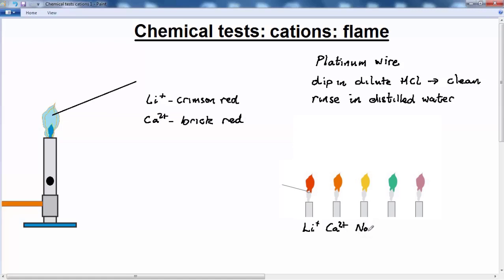After that we've got sodium which is a bright orange-yellow color, then the very easily identifiable copper ion flame (Cu2+)—that's this beautiful blue-green turquoise flame. Finally, we've got this lilac flame which is the potassium ion. For your IGCSE or GCSE chemistry, you'll be required to remember the flame tests for these five ions.